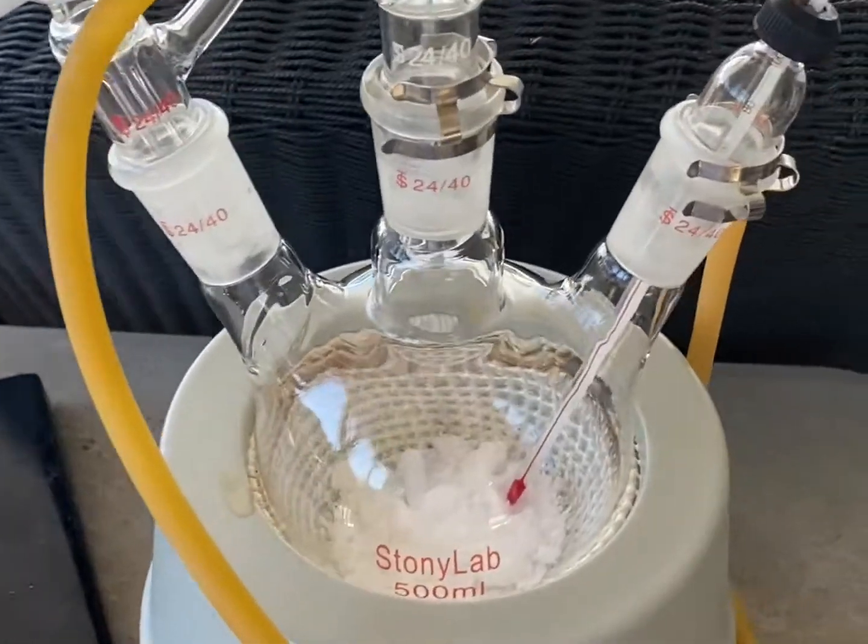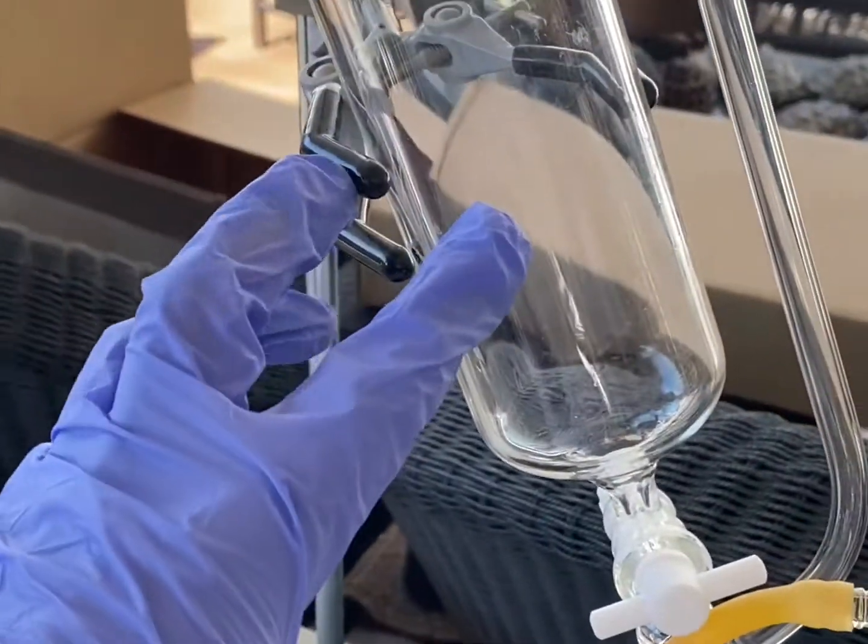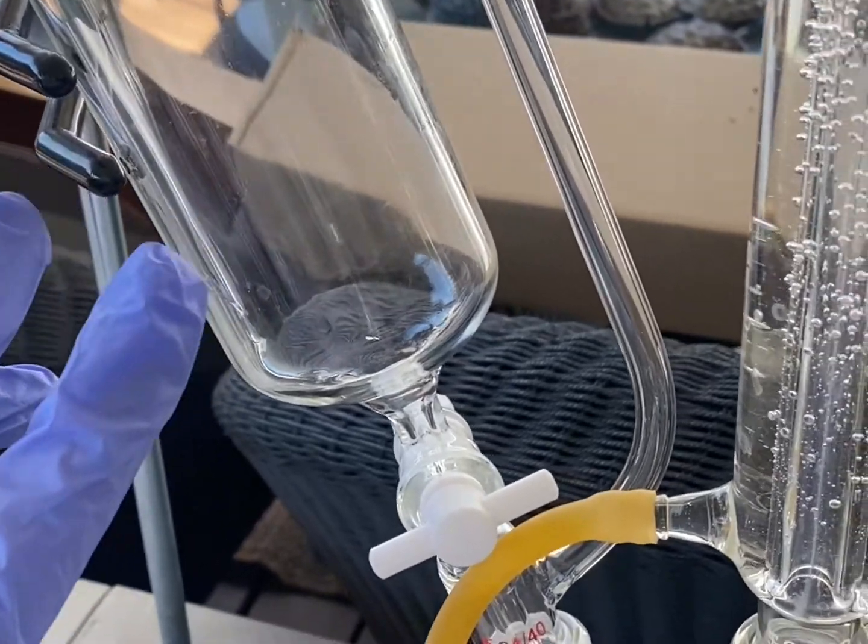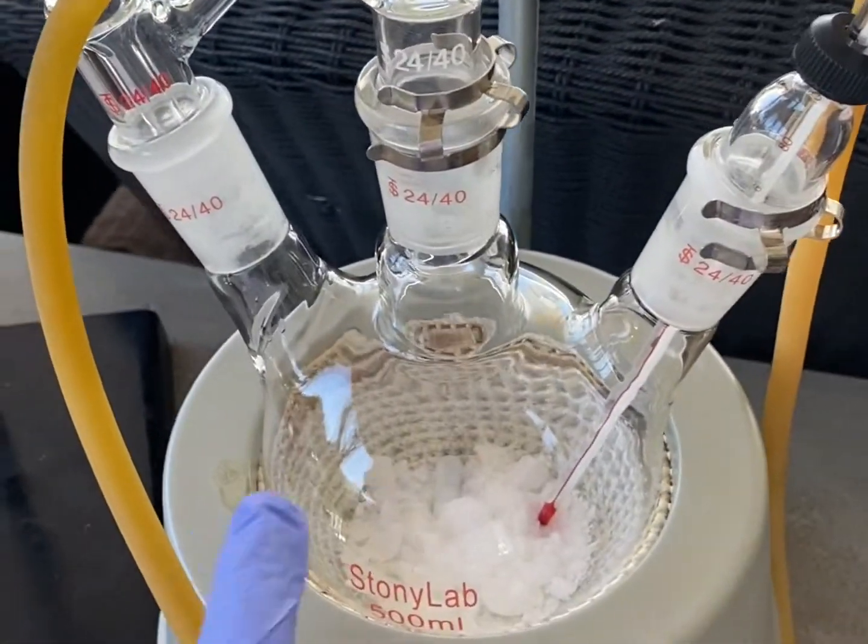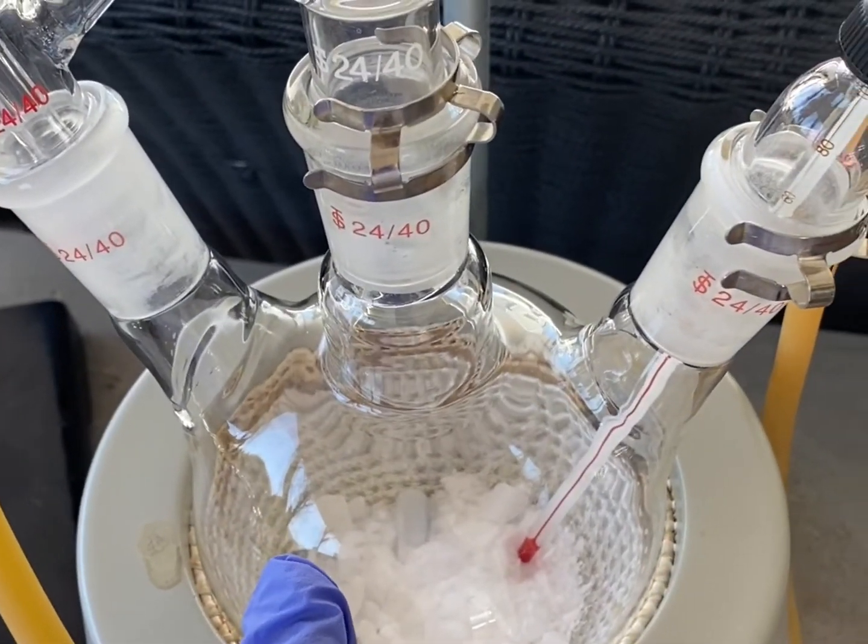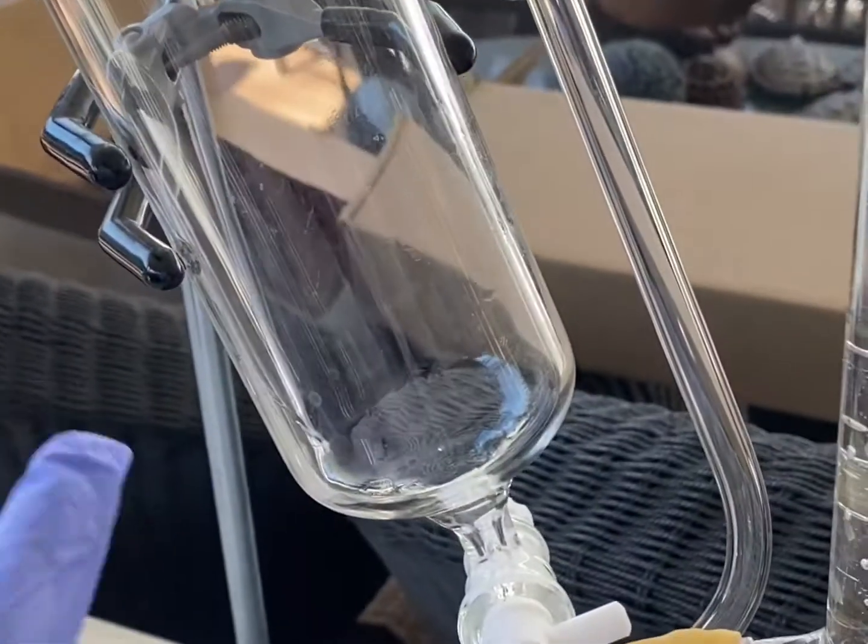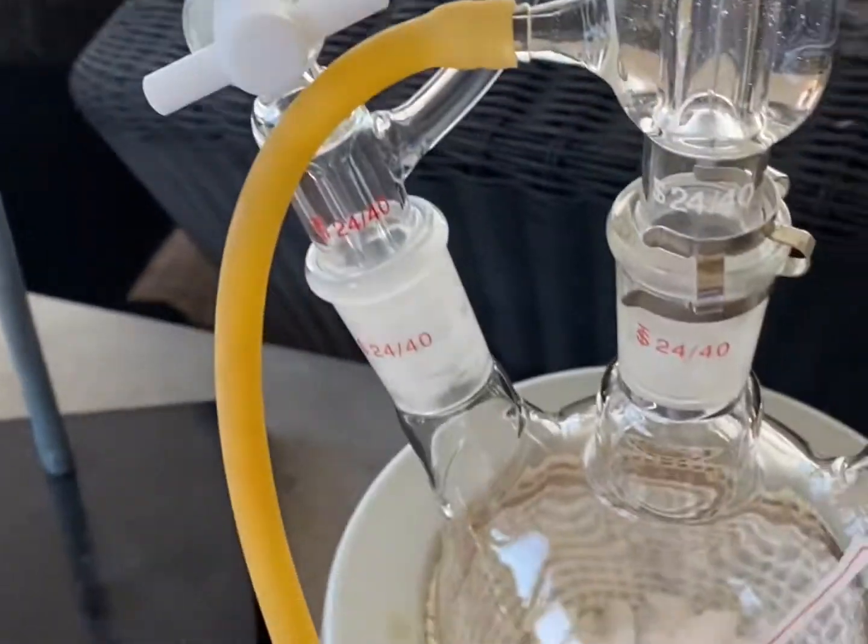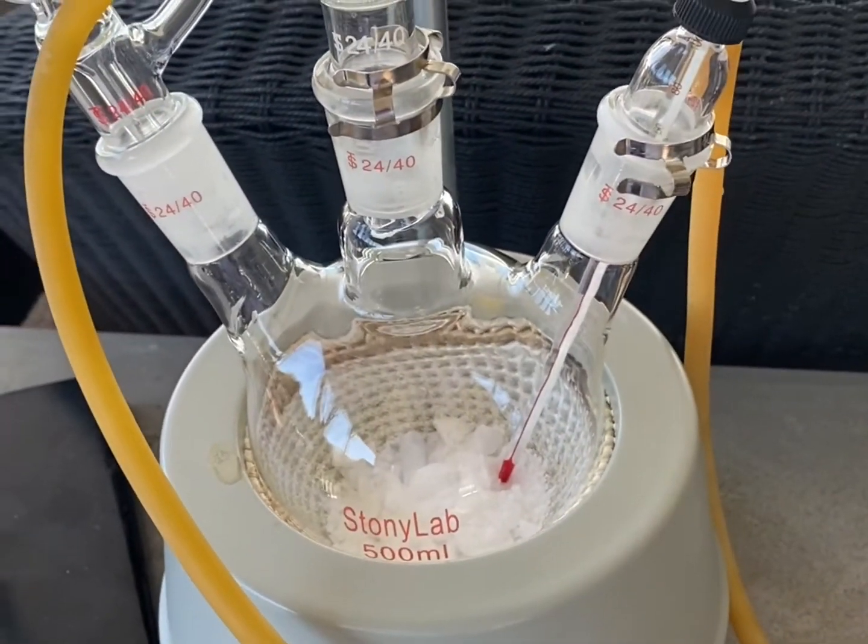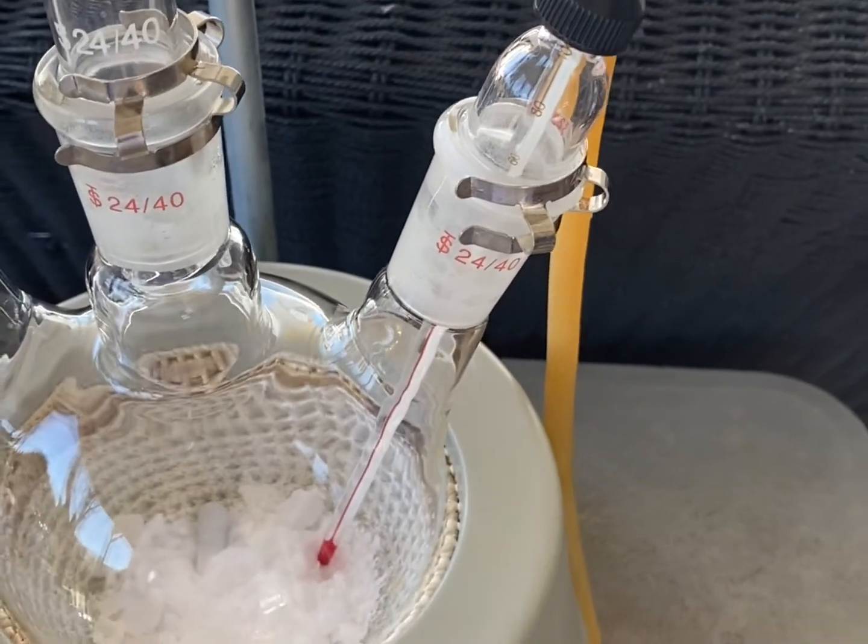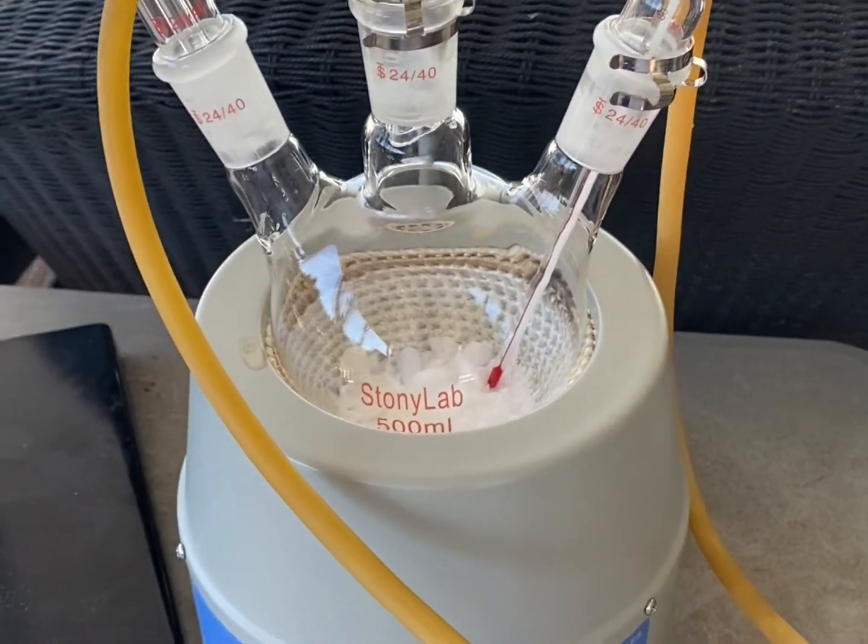To do that, we're going to load this with 45 ml of 93% sulfuric acid, and we're going to start heating this. Once it melts and gets to about 160 degrees Celsius, we will drip in the sulfuric acid over the course of about 10 minutes, and then let it stir for an additional 5 minutes at 160 degrees Celsius, and then let the mixture cool down.